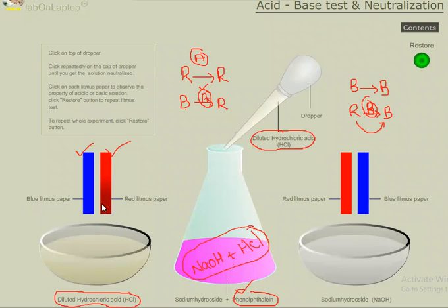A little bit, it is wet, but there is no change in the color. Now keep our blue paper in this solution and observe it. Is it turning into any other color? The solution is acidic. How are we saying it is an acidic solution? Because this blue paper is completely turned into red when it is immersed in this solution. So which type of solution is it? Acidic solution. Hydrochloric acid solution is an acidic solution. So here blue paper turns to red. Is it clear?